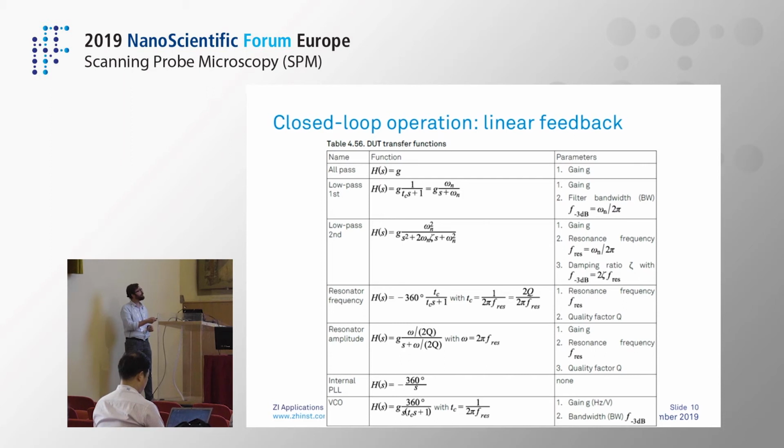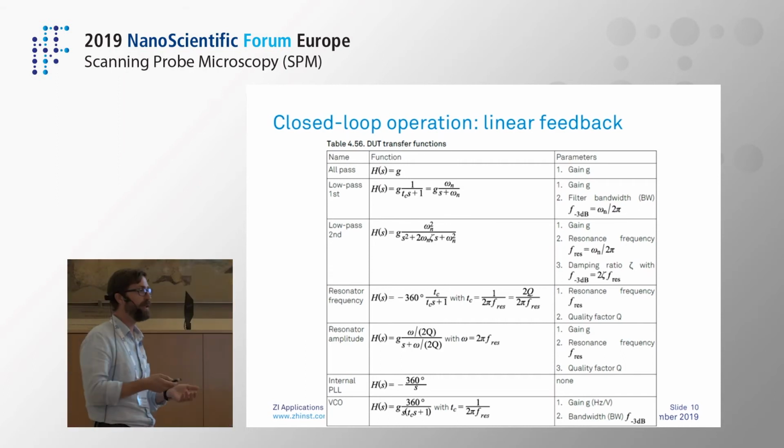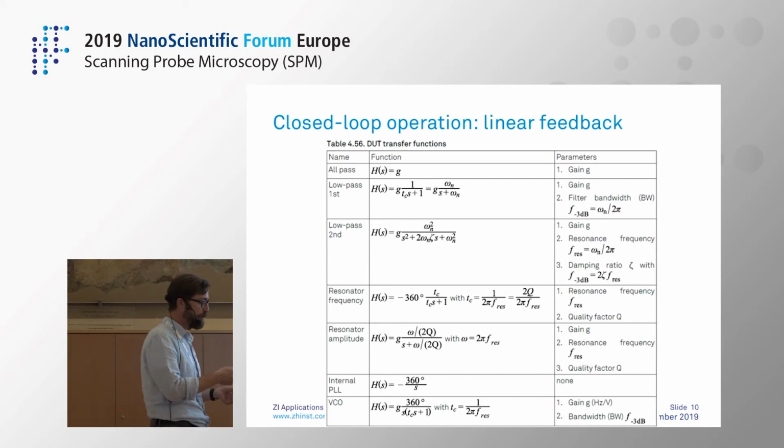But if you don't necessarily know that, you can have other models, and that's actually very versatile because you can use it for Kelvin probe, for DFRT, for other contact resonance modes, or even some interferometric cavity feedback, because in the end you can be quantitative and measure the parameters and then apply such a filter.